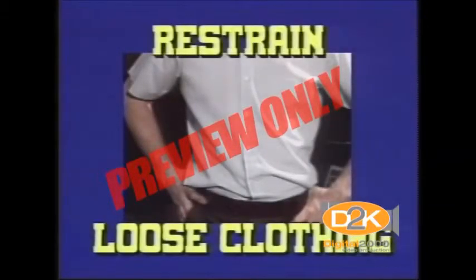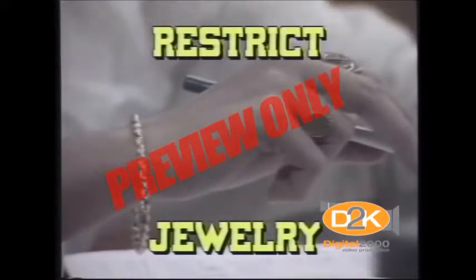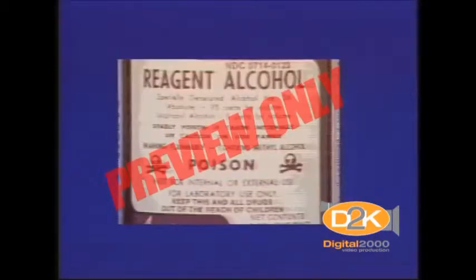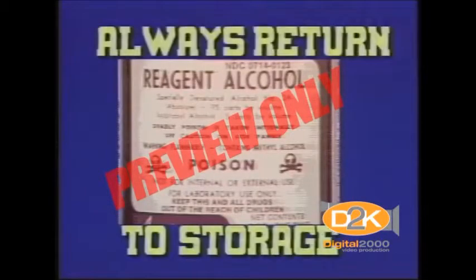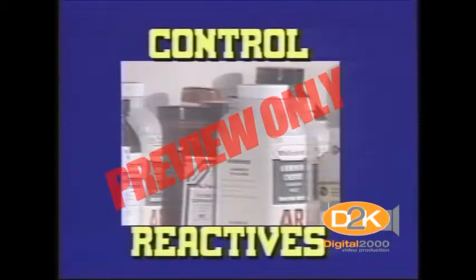Restrain loose clothing to avoid causing a spill or absorbing a chemical. Keep long hair tied back and restrict dangling jewelry. Never leave heat sources unattended, such as gas burners, hot plates, sand baths, or electric tools and motors. When working with reagents, always return them to proper storage. Don't leave them sitting on work benches. Reactive chemicals should be carefully controlled to avoid spilling or breaking. Don't set them near lab bench edges.